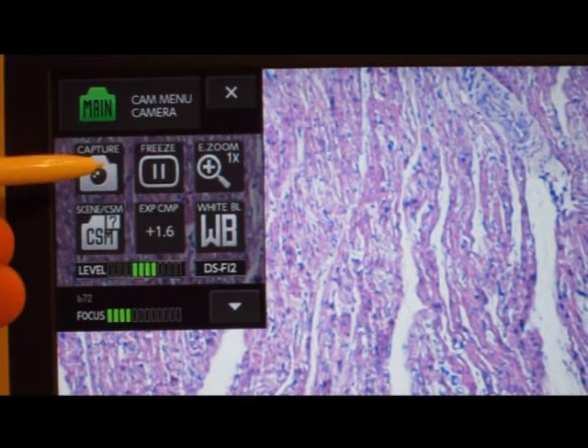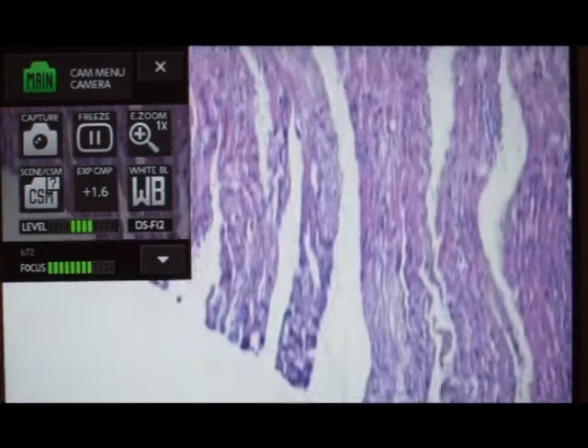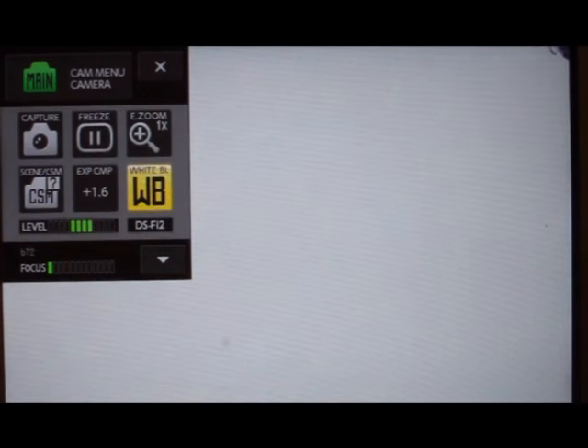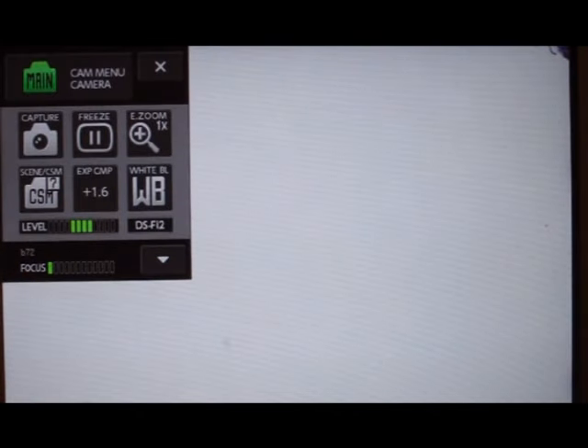Here you can adjust the brightness, select a custom setting, use the focus gauge, or magnify the image for sharper low-power photographs. If a white balance is needed, just move the stage to a clearer white area, click on the white balance icon, click OK, then bring back the sample.